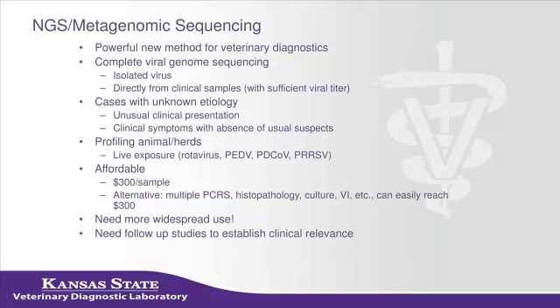I'm a big proponent of we need to use this more often. We need more veterinarians to request this. But the final point here, it's very easy to see we find a lot of stuff that's interesting, but really, more often than not, it raises more questions than provides answers. So be forewarned, you may get an email from Doug or myself or someone that says, hey, we found this and we have no idea what it means. But it's good for graduate students if I'm looking for projects.